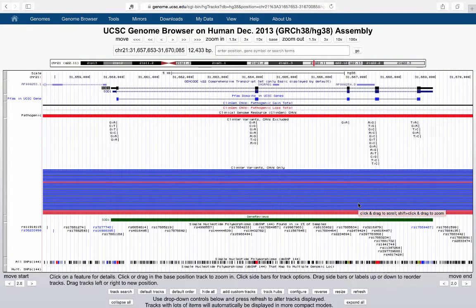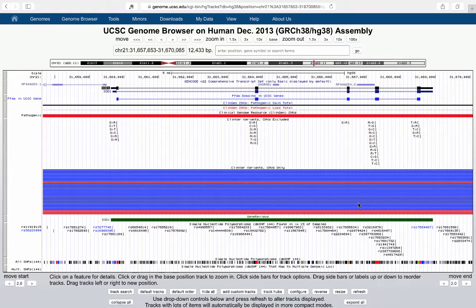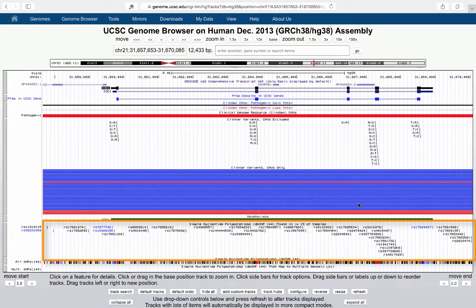144 refers to the version of the dbSNP database, so you want to make sure you're looking at the same version across tracks. dbSNP is a database of SNPs, and what UCSC does here is break it down into sub-tracks so you can understand which are the common SNPs and which are rare.